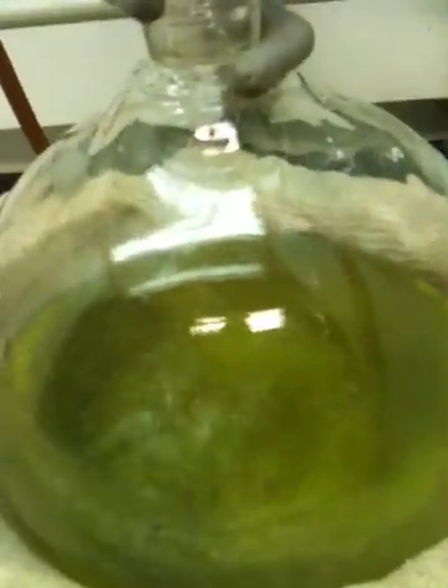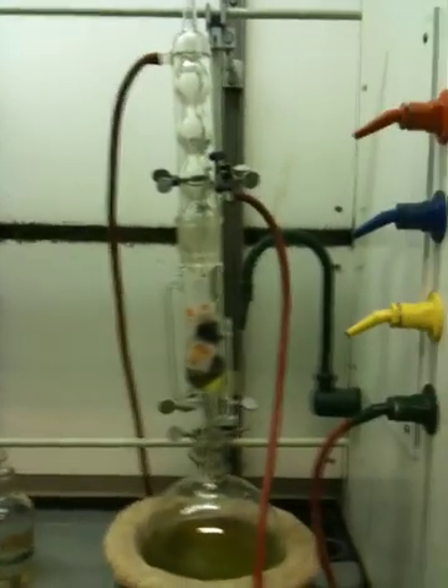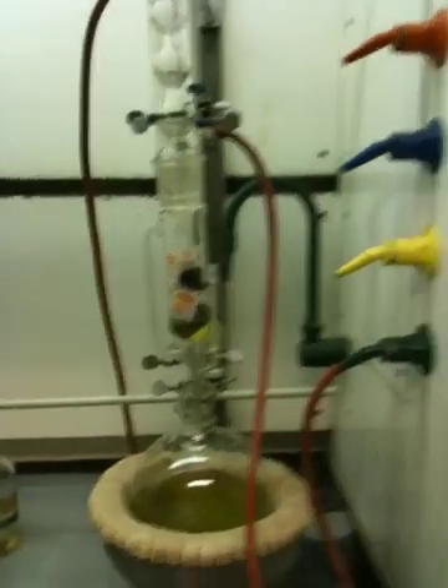Again, look at the liquid dripping — it's clear. So I want you to think about how this works. And when you're in lab, take a look at it. It's in one of our dispensing hoods. I'll see you in class.